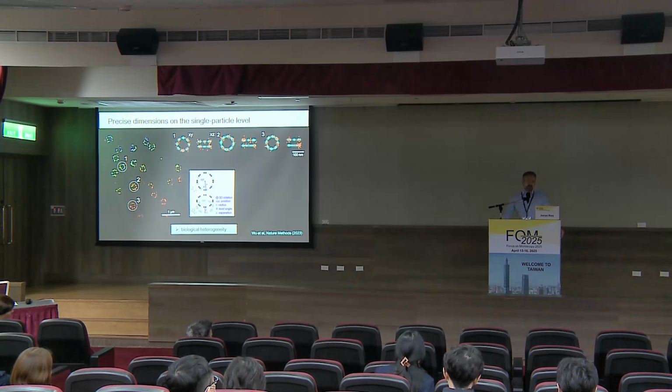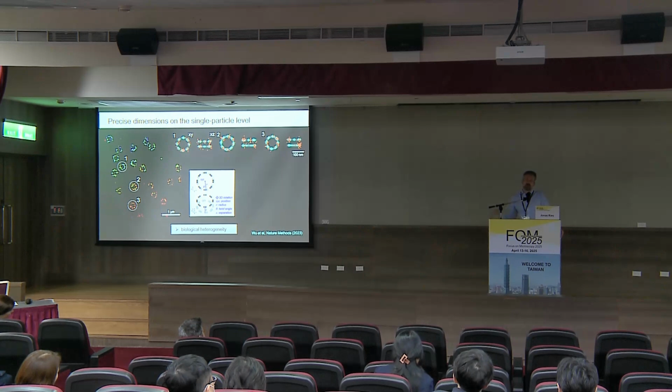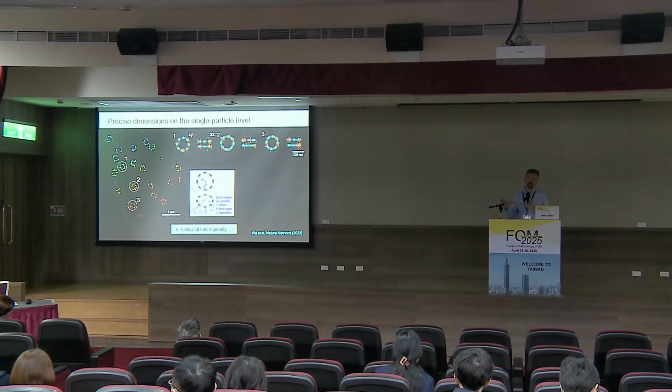Everything else is standard, or it depends on filtering. But then it's also a bit subjective, because we don't get an image out. We get these localizations, and then it's up to us to decide if we want to see all of them or only the brightest ones that were localized very well. That depends on the question. It depends on us how we render an image, at what spatial scale, to best understand our data, or if we directly look at these point clouds and analyze them. So there is a lot of subjectivity in data interpretation, and many parameters you can set there, but the fitting process is quite straightforward. Okay, I understand. Thank you very much.